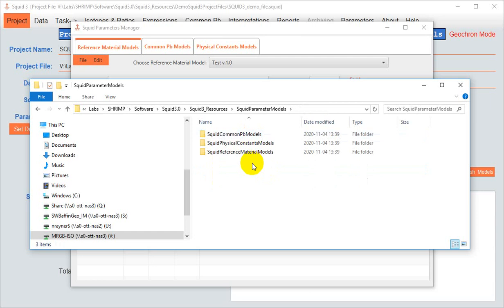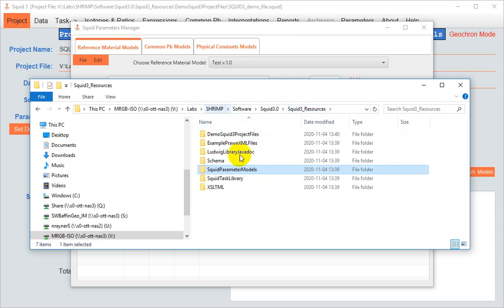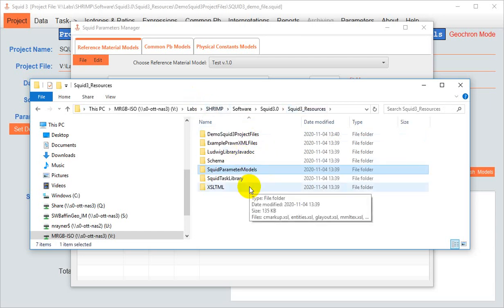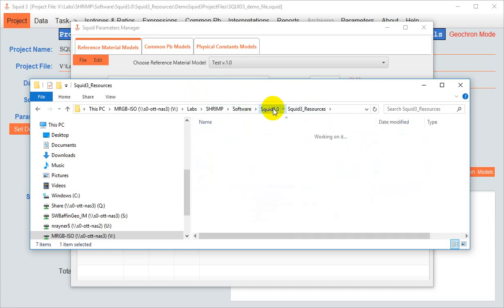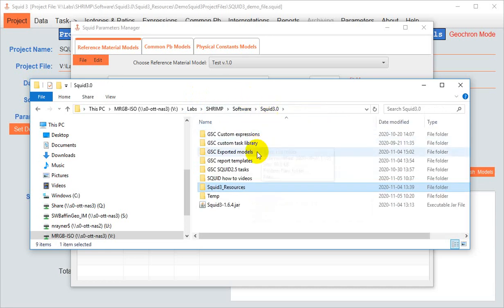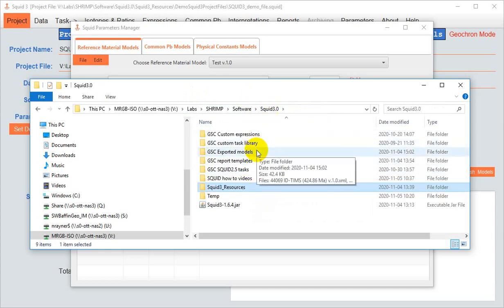Well, it's not a good idea. This folder gets rewritten every time you launch .squid, so it's a much better idea to put your exported models in a separate folder.